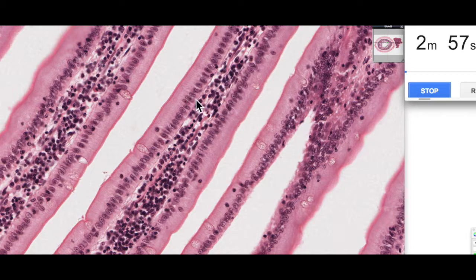So if you remember we talked about the basophilic nature of the nuclei and we can see the different staining intensities for the different types of nuclei and we'll talk about what that means probably in another video.